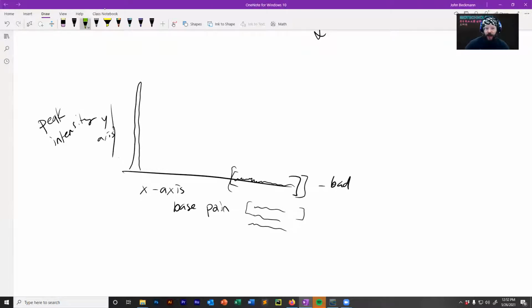So what you want to see in a chromatogram is you want to see a couple different things. You want to see a high peak intensity. You want to see distinct peaks. So like as quanta, here's peak 1, here's peak 2, and then you would know that whatever, this one was an A, this one was a G. Does that make sense? And what you don't want to see, or maybe you do want to see it in a certain experimental context, but what you don't want to see is a bunch of data that has patterns like this, where you're getting overlapping peaks. That's bad. So there's two types of bad data: low peak intensity, and then overlapping peaks.